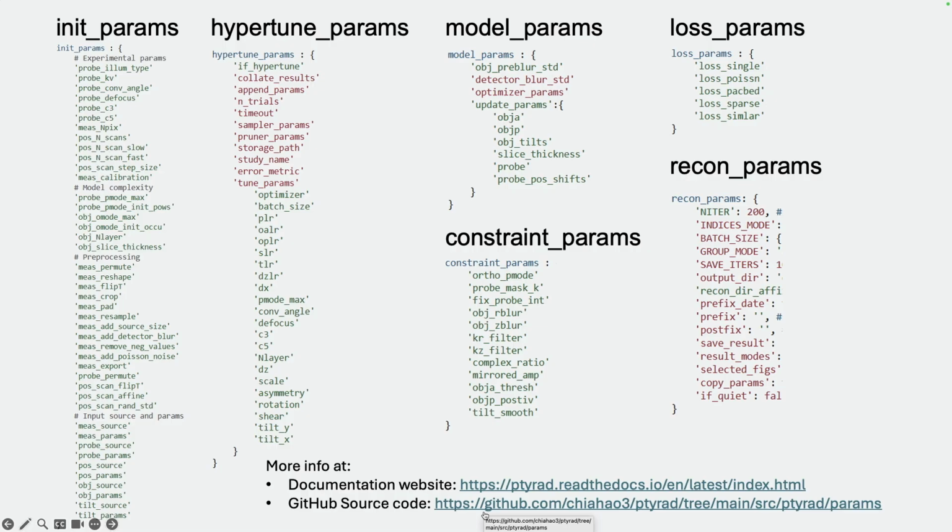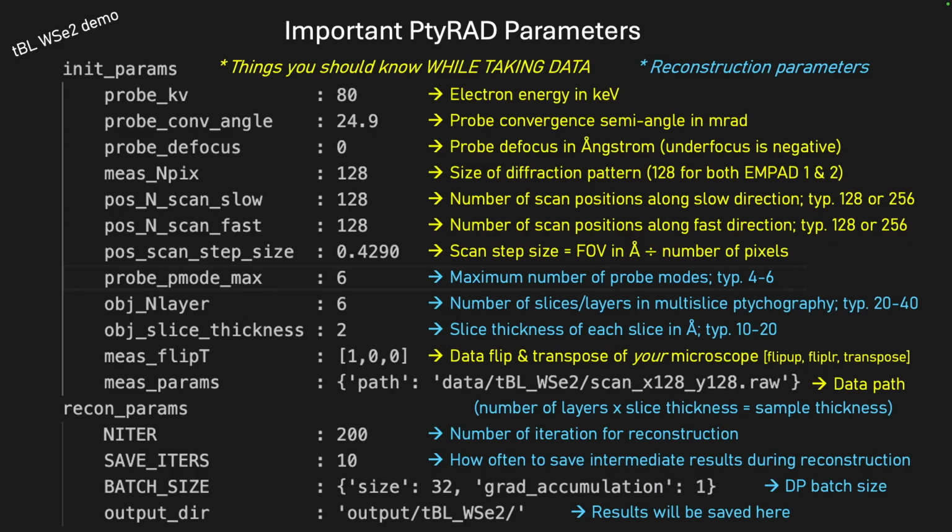And with these parameters, PtyRAD is incredibly customizable, but it requires a lot of experience to use it to its full potential. It's important to note that it is still possible to obtain a successful reconstruction by tweaking only these basic parameters that we have covered in this video.